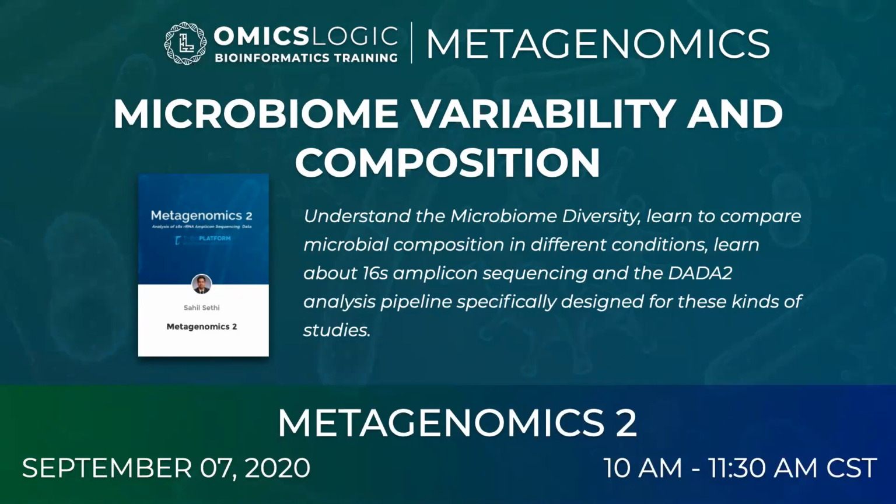Now, a lot of that information is going to be found in Metagenomics 2. So if you do have time, please try to go through Metagenomics 2. We will explore there the DADA2 pipeline. It's a full pipeline that includes the phyloseq R package. So we will actually do some more coding in R to know how to visualize, and we'll finish also the first exercise. So we'll look at how to visualize and perform comparison of such data sets.